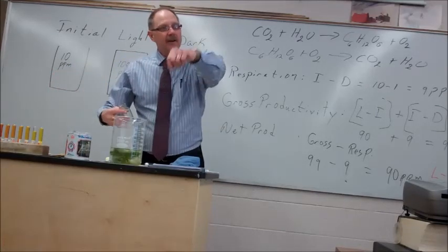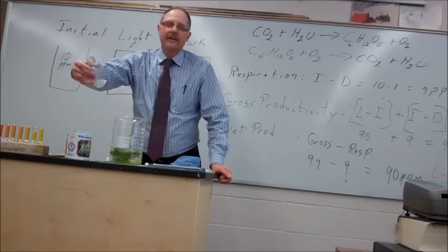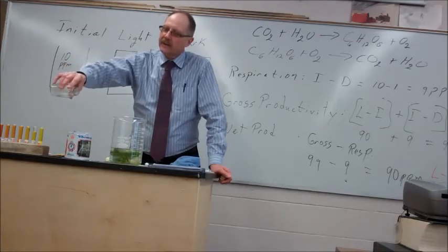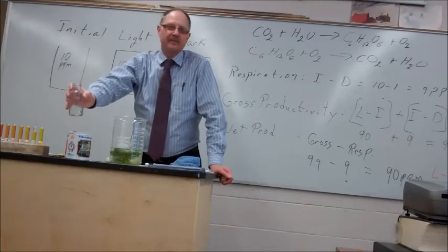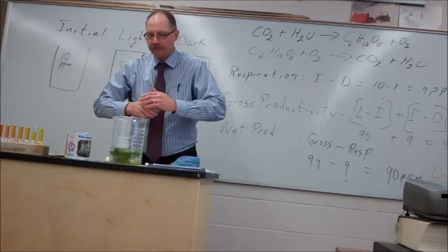So if we take our initial reading right in the aquarium, and then you go blubbing water in here, you're going to have a false reading. So what you need to do is carefully dip this in and let the water run in slowly without adding any oxygen to it. So that's the main thing you have to watch out for.